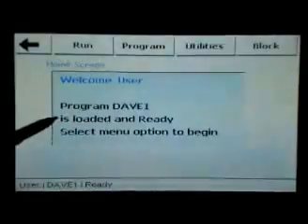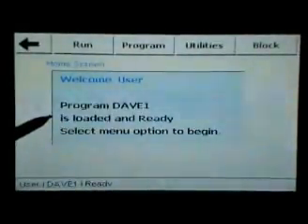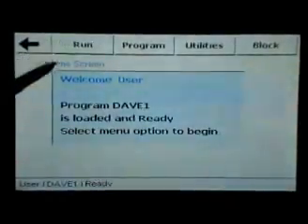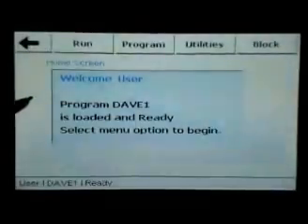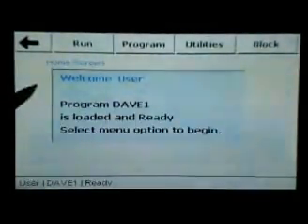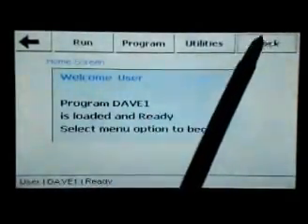Quite often when you use your thermal cycler, you run the same program over and over, and we've set this up to be convenient where you can immediately go directly to the run button, put your samples in the machine, and you're off and running. But let's assume this is the first time you've used this machine, and let's walk you through a couple of the other steps. You'll notice up here the block button.